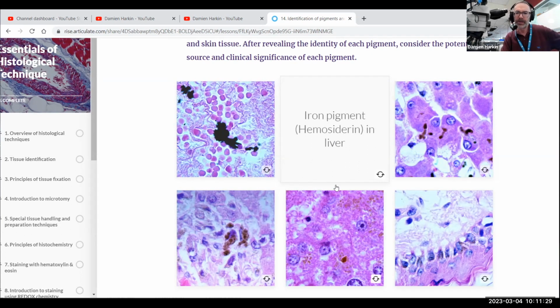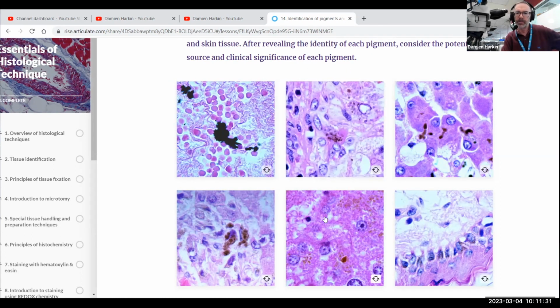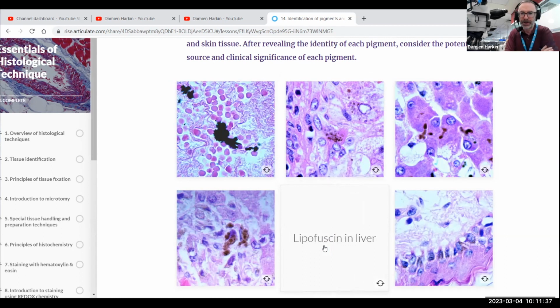As for this final one down the bottom here, this is according to our notes that we have and the way that it's been identified subsequently. This is lipofuscin or age pigment. The best way that I find to interpret what lipofuscin is that as cells get older and age, they just get a bit lazy, as we all do with age, and we're less efficient at taking out the garbage. So you can get accumulation of these metabolites, breakdown products within the cell, and rather than being efficiently discarded and recycled, they just tend to accumulate.